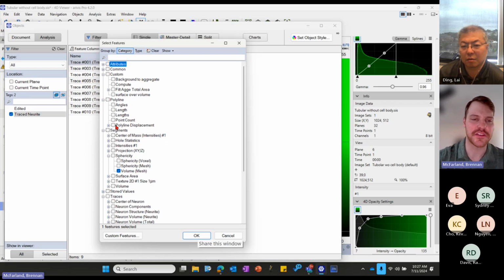You can probably pull out volume of this too. We have also segments. So segments would be what we were looking at Tuesday when we run a deep learning module to get objects segmented out. So like these nuclei, for example, or proteins, using a blob finder or Cellpose, those would be considered segments.